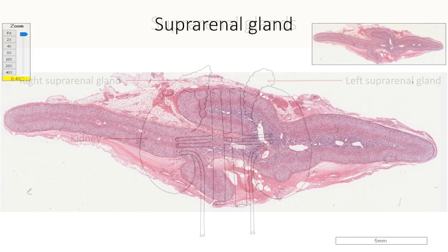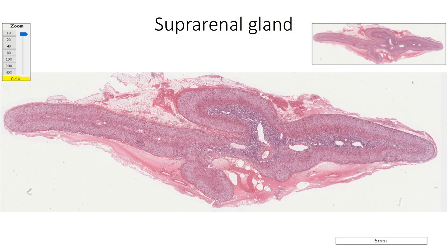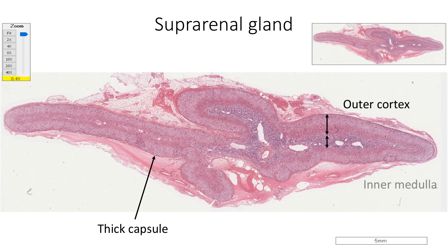This is a section of suprarenal gland under low power magnification. The gland is covered by a thick capsule. It has an outer cortex and an inner medulla. The cortex develops from mesoderm and secretes steroid hormones, while the medulla develops from neural crest and secretes catecholamine hormones.